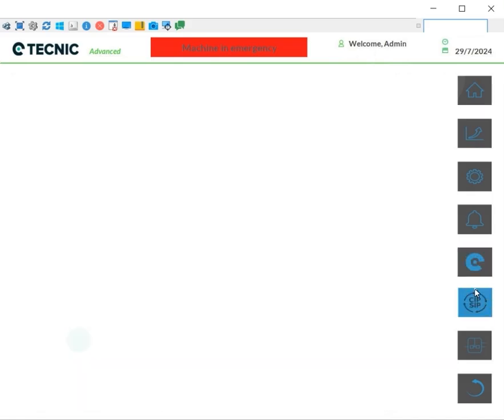We also offer a screen for in-situ cleaning and sterilization of the equipment, allowing for automatic configuration. In the case of glass bioreactors of the eLab range, this screen will be blank. In other cases, like the stainless steel bioreactors of the prod range, this screen will be enabled.